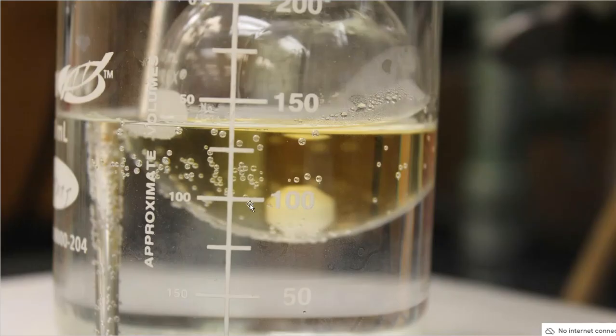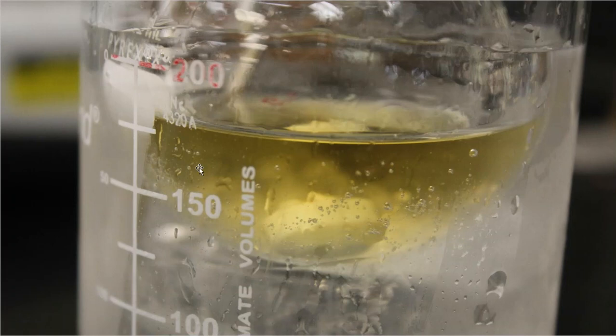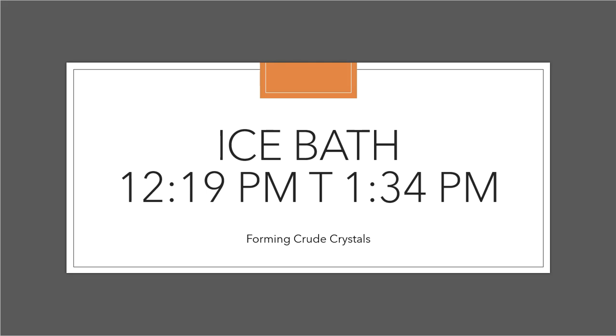All right, so here is the close-up of the final solution color after the cyclohexene was involved. Then it tells me to put it into an ice bath, so I do. This is a beaker that's just full of ice, and you can see my beaker with the trans-cinnamic acid product in there. This ice bath is reading about 8.3 degrees. You can make observational changes if you want to, but that's what it looks like close up. It stayed in the ice bath from 12:19 p.m. to 1:34 p.m. Now, I take it out of the ice bath.